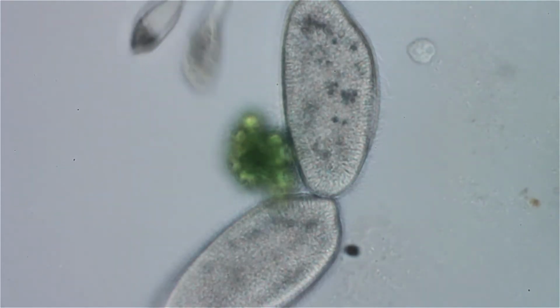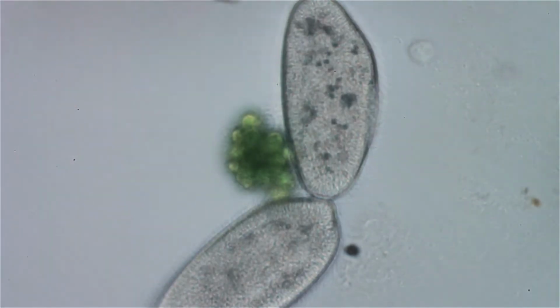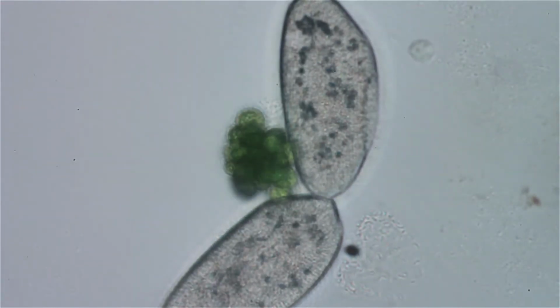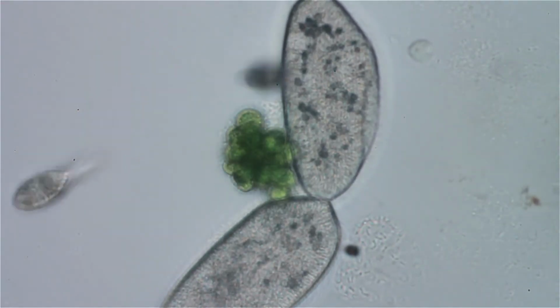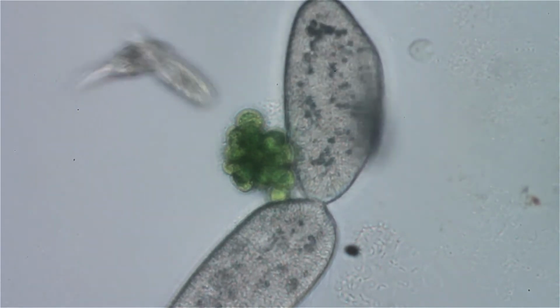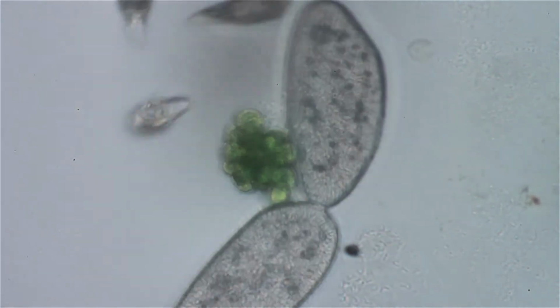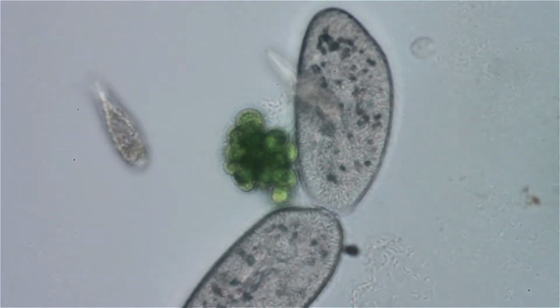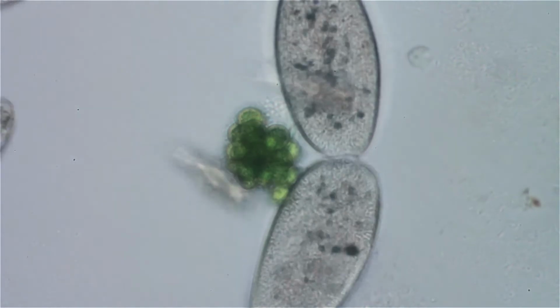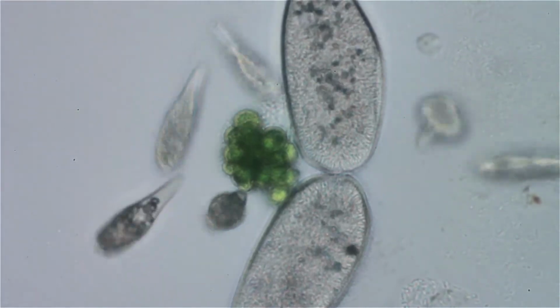And the Paramecium's pinching off pretty tight there. Won't be long. Overall, I think it took about 20 minutes, which you won't see in this video because I've cut it down to just over 11 minutes. Otherwise it'd take forever to upload.